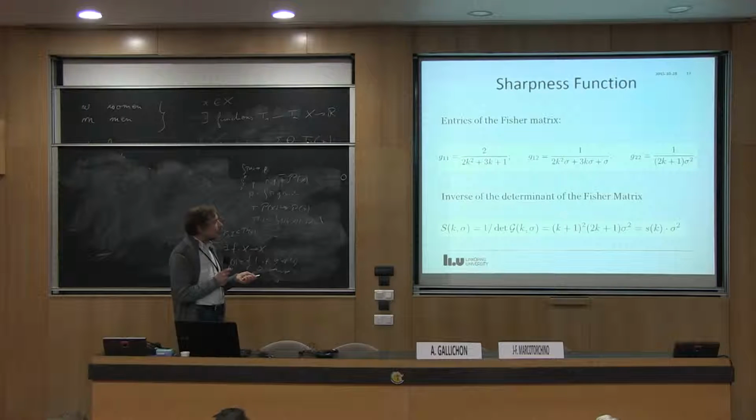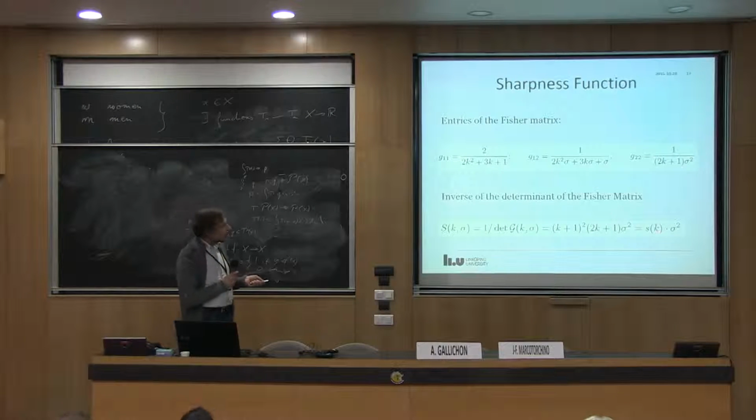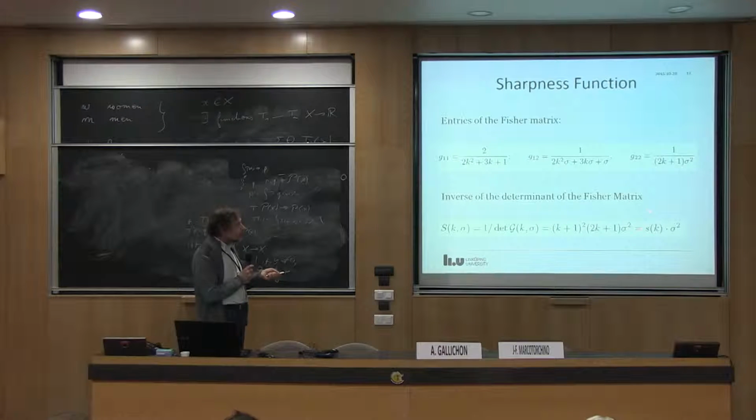And then you have a multiplicative factor that modifies the significance of this variance part. So you get some extra information on the shape of the tail that tells you how reliable your variance is.